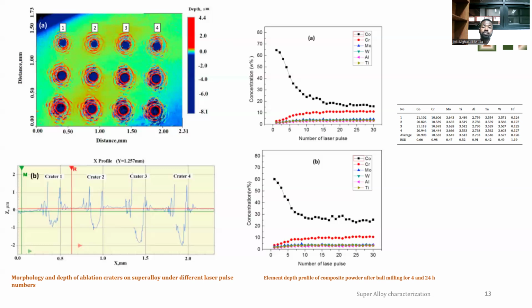So by this, you will have 3D characterization. The depth profiling here is around 8.1 micrometer, but you could increase it by increasing the pulse. And also, this method we could say is a non-destructive system, because some will ask, okay, it will apply to the surface, so it will remove some of the layers and create plasma. But you imagine the induced beam or the emitted ions, which will be like a fingerprint for the characterization. But it's micro focus, so it will just track a very, very tiny domain within those layers.